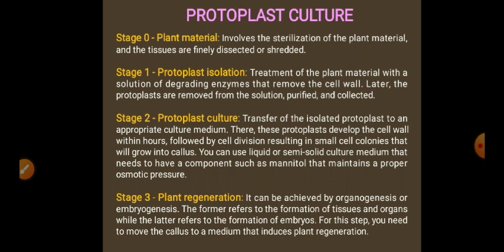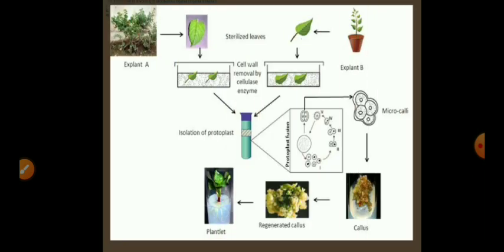During the protoplast culture, okay, in this slide we are taking 2 different explants, explant A and explant B. From both explants we take leaf, cut it into small segments and digest with enzymes. After isolation of the protoplast, what will happen? We have fusion. Generally the protoplast fusion happens by polyethylene glycol, and after the fusion we will generate heterokaryons.